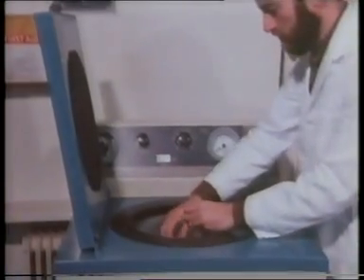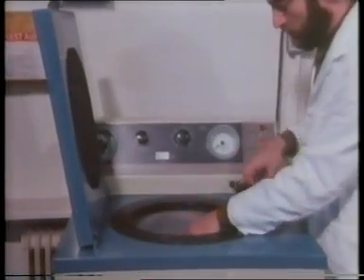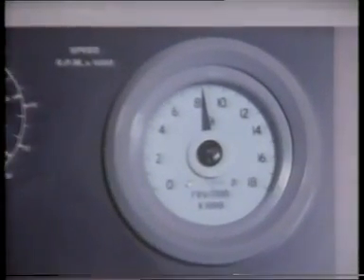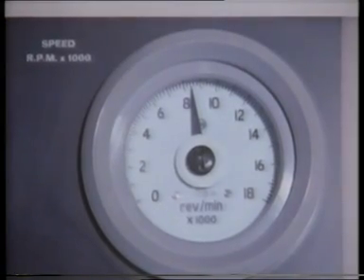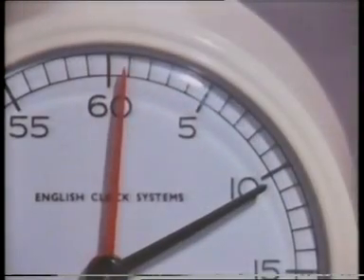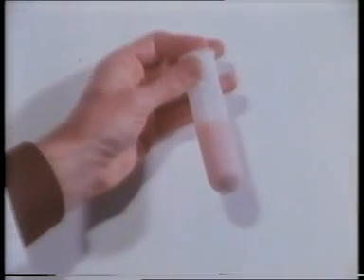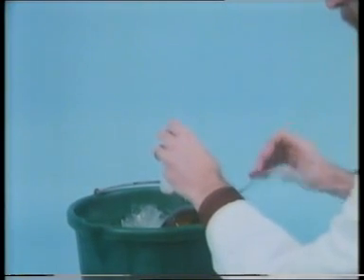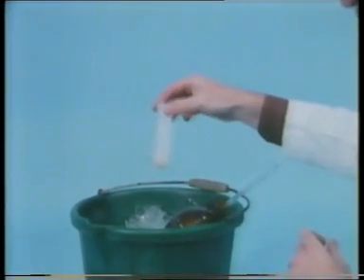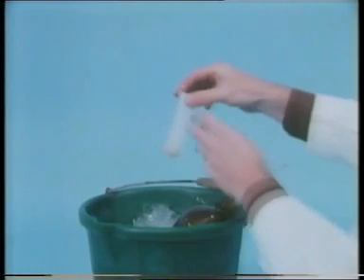Then it's centrifuged again, this time at over 8,000 revolutions per minute. After another ten minutes, the mitochondria have collected as a pellet at the bottom of the tube. The supernatant liquid is poured off, and the mitochondria are suspended in fresh, cold sucrose solution.